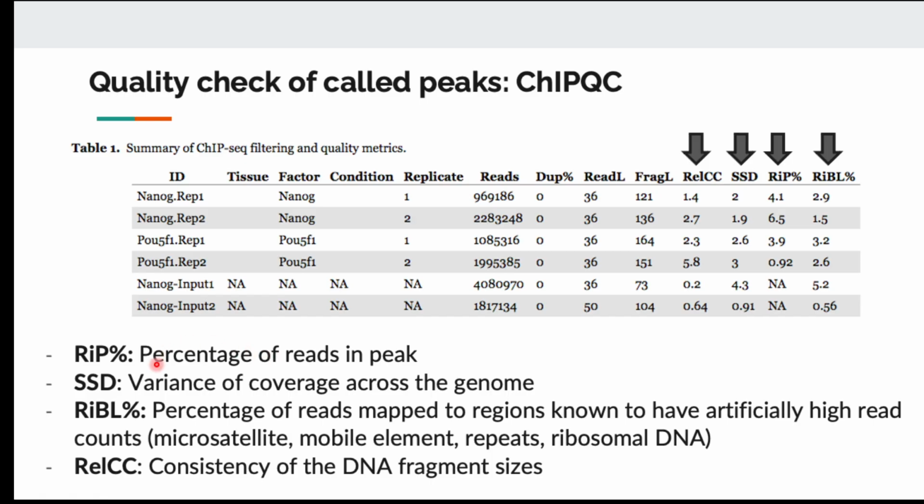So if our sequencing data, when we align to the genome, align outside of the peak, that means we have a lot of free DNA that we didn't want to get. If we do a perfect chromatin immunoprecipitation experiment, all the DNA that we get should map to the peaks. So the percent of reads in peaks here can tell us how much sequencing data corresponds to the design of our chromatin immunoprecipitation.